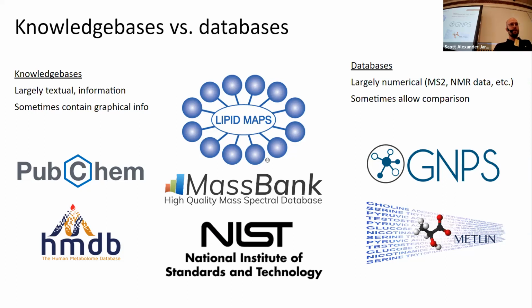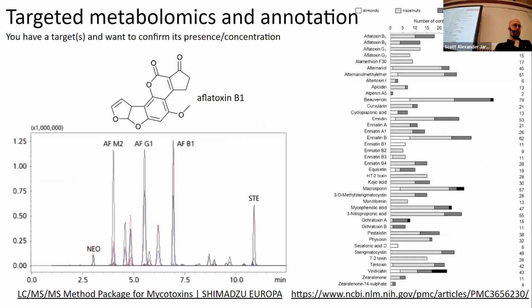Yeah, so these are the available databases out there. This is what you're mining your data potentially against. Or of course, you have private databases. So many labs still have their own databases. Obviously, industrial partners have their own databases, and you're probably doing some sort of combination of these two. But it's good to know what to look out for and where some pitfalls might occur.